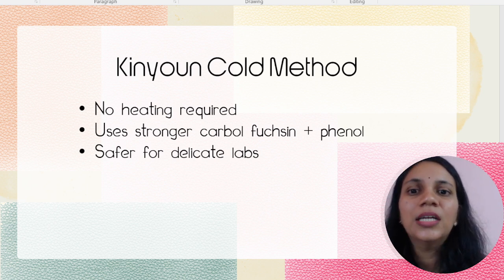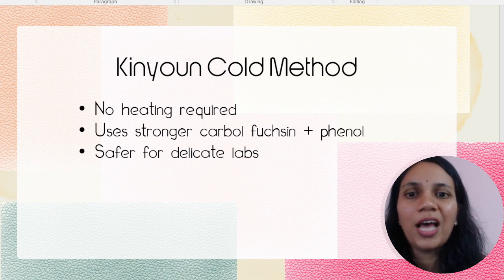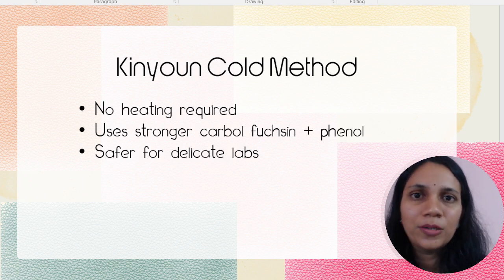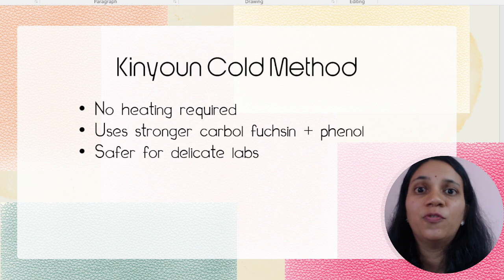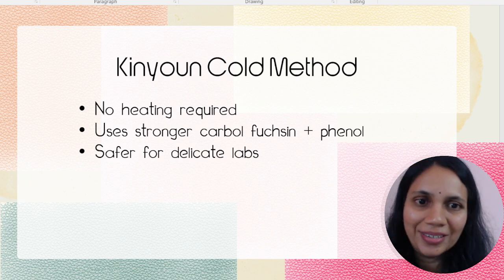So this method avoids using heat, and rather it uses stronger concentrations of carbol fuchsin and phenol that allow it to enter inside the waxy mycolic acid, and also the time for which it is kept is a little longer as compared to the Ziehl-Neelsen method. Because we are not going to use any sort of heat, it becomes very safe especially for labs, because open flames are not recommended.